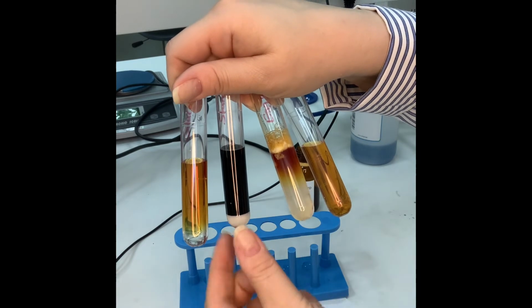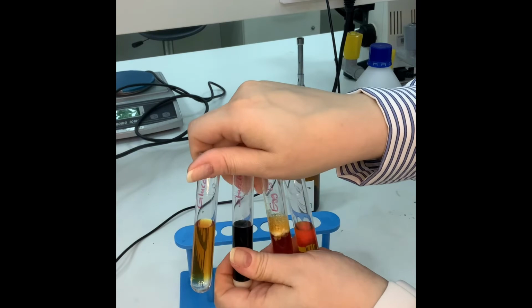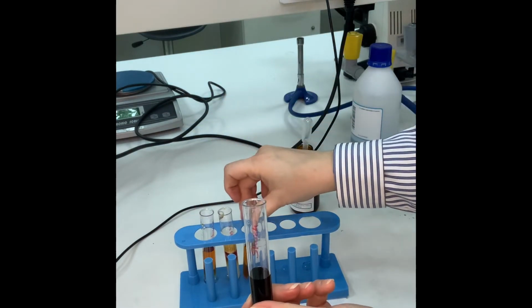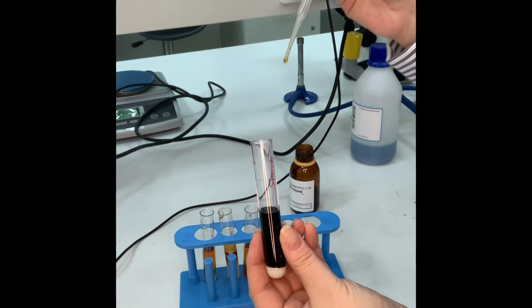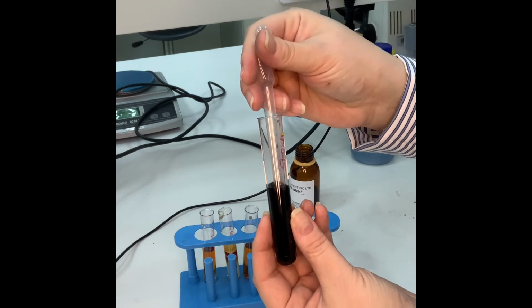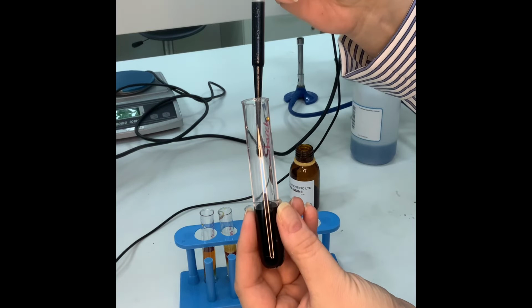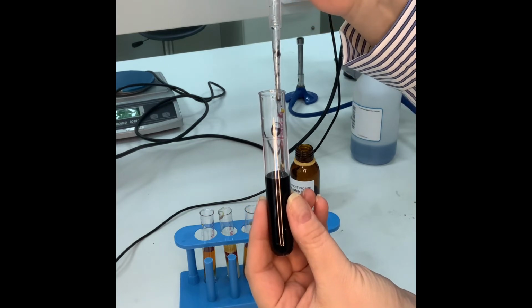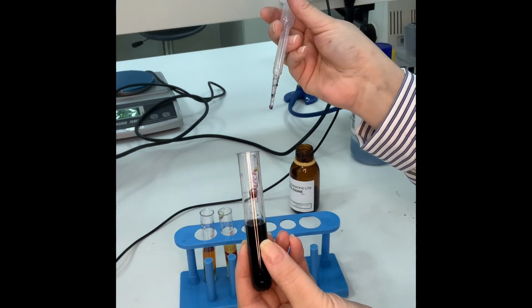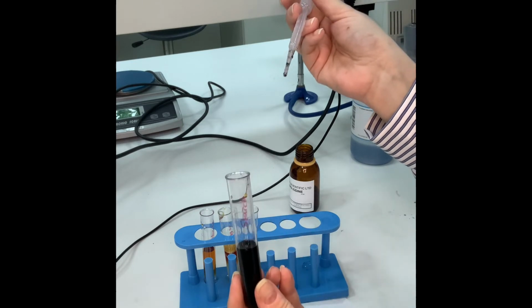Now the starch has precipitated over here, so I'll just give it a mix for you to look at it. Because it's very heavy, this is the black blue coloration that changes when you add iodine to starch. It reacts with it. This is why it gives a different chemical color change.